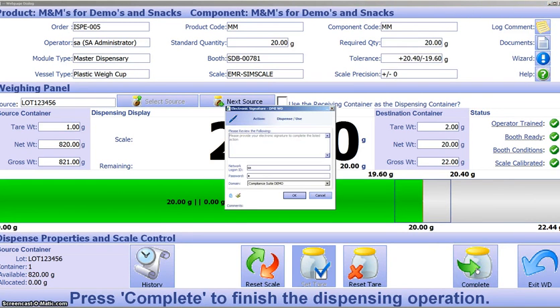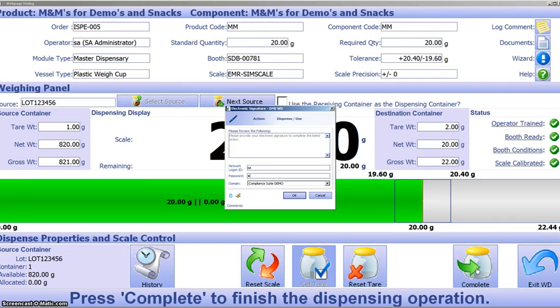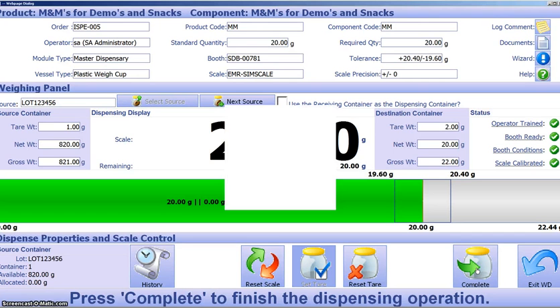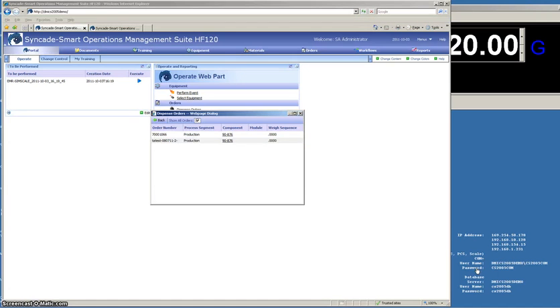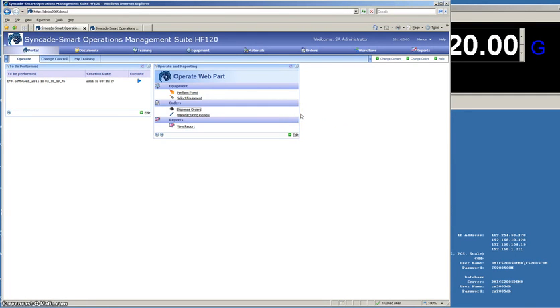The operator is requested to put in an electronic signature. The system supports part 11, so all the electronic signatures meet the requirements for that. Once the electronic signature is met, the system will print out a barcode and complete the order. In the background, the ERP system is notified that the material has been dispensed, it's work in process, whatever else needs to take place.